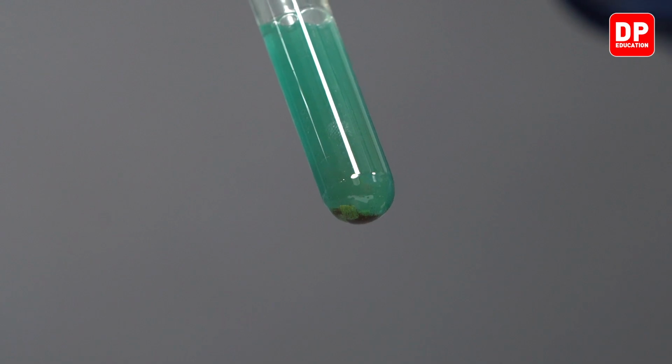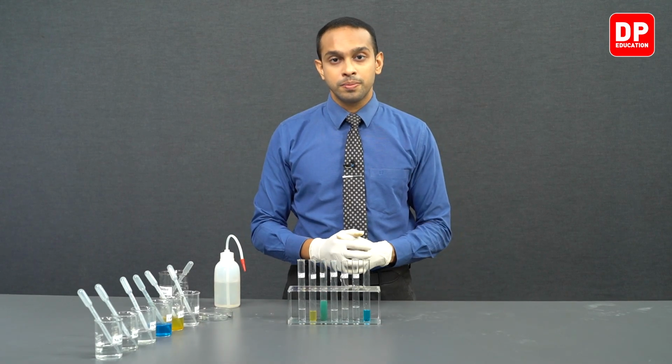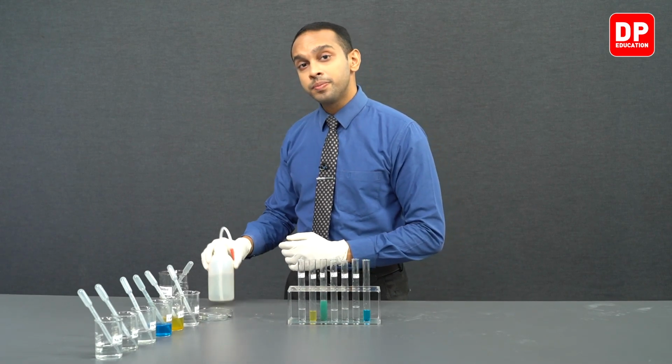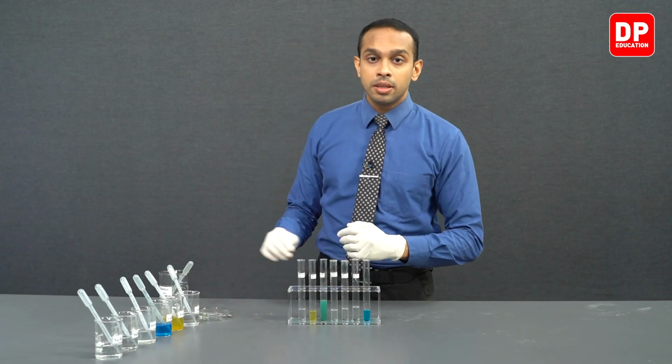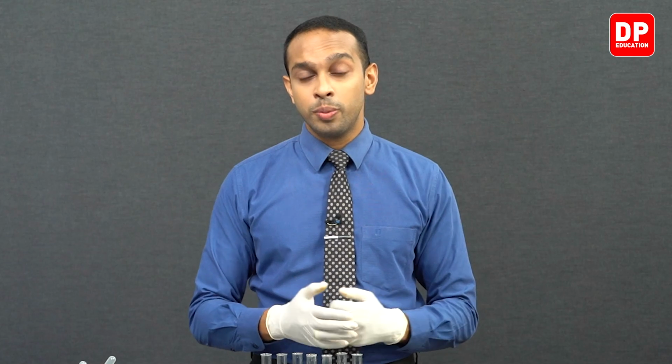Now students, at the bottom of this test tube, the brown color precipitate that you observe is copper. So copper 2 plus ions do get displaced as copper solid. So lead metal was capable of displacing copper 2 plus ions as copper solid.